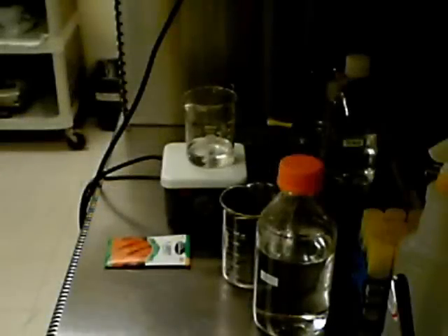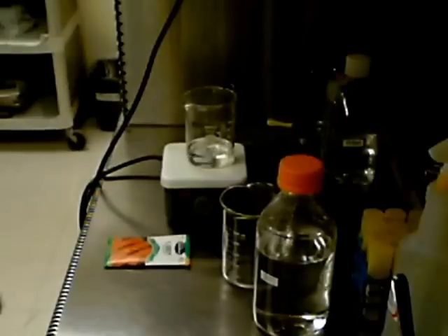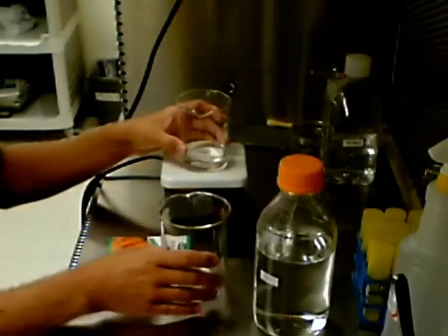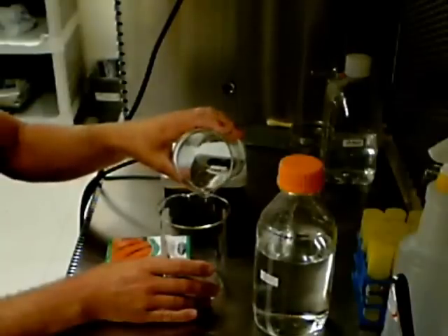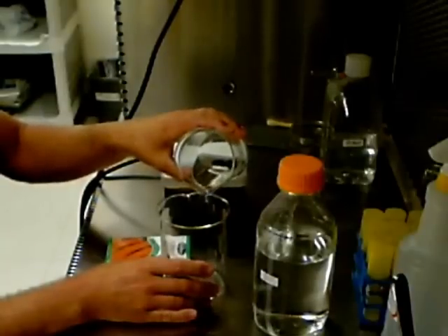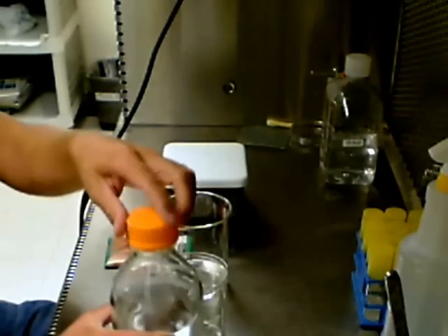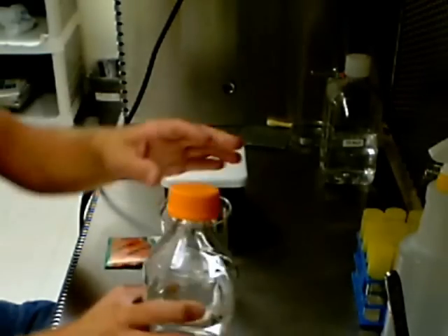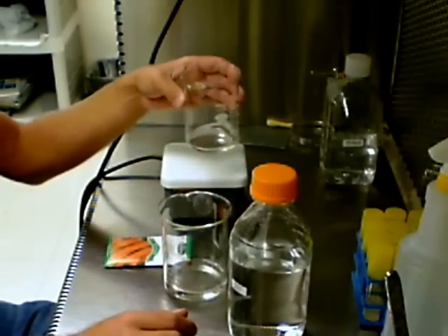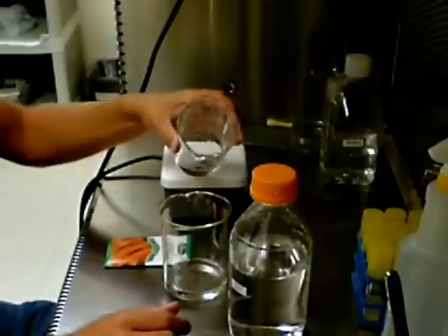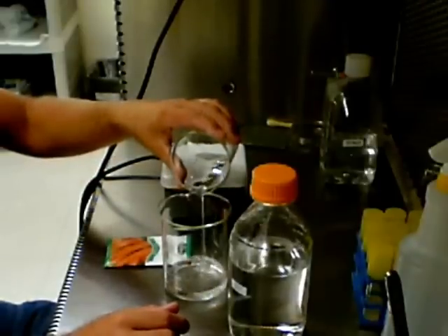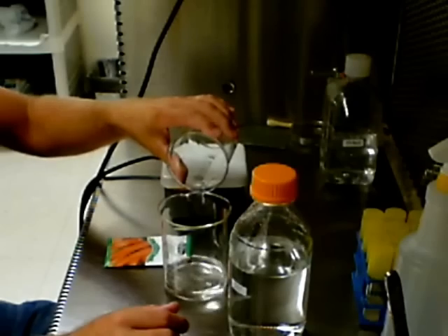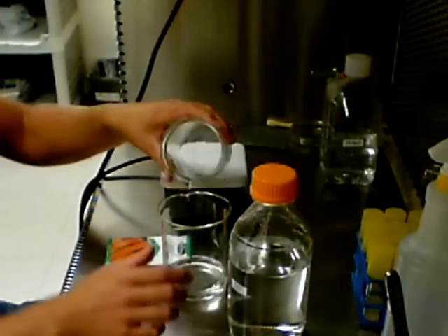After the seeds have been stirred, pour off the bleach solution being careful not to pour the seeds into the waste beaker. Remove the stirring bar from the beaker and rinse the seeds with about 150 or 200 milliliters of sterile distilled water. Hand stirring the seeds will work just fine for this application. Pour off the distilled water again and repeat this procedure three or four more times to make sure the bleach is washed completely off of the seeds.